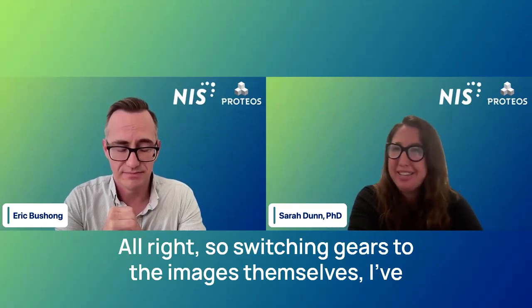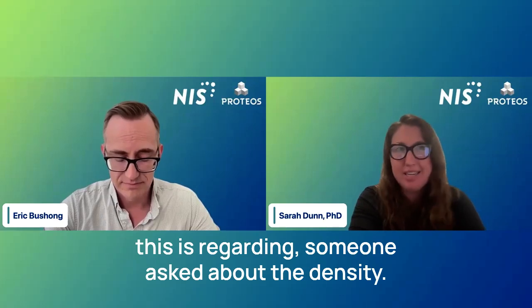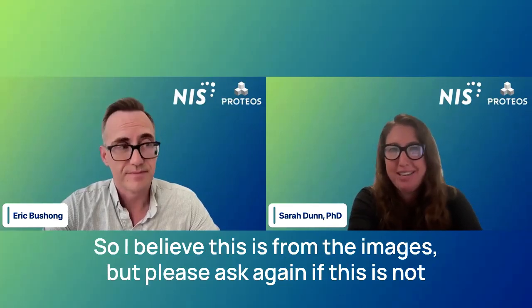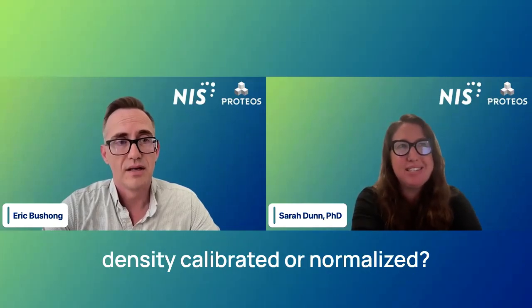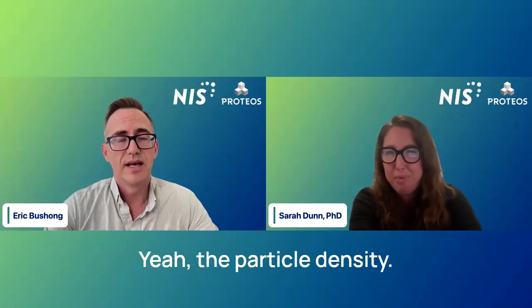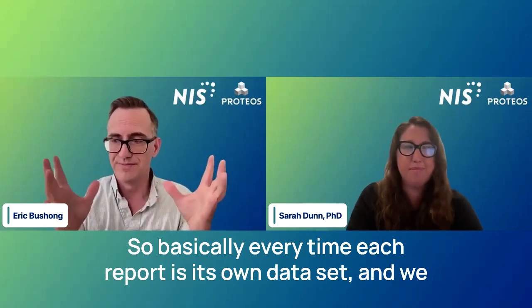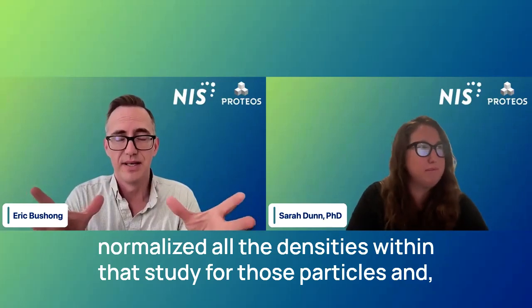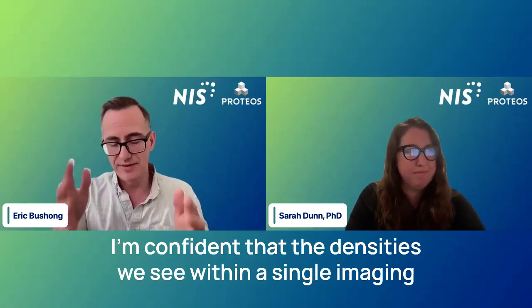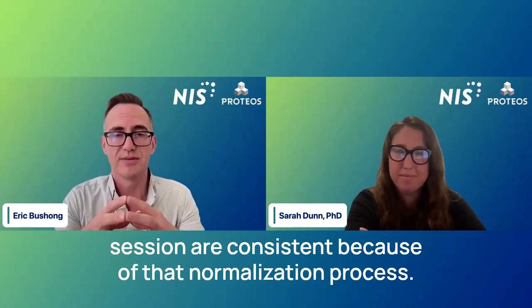Good. All right, switching gears to the images themselves. Someone asked about the density. I believe this is about the images, but please ask again if this is not how the question was meant to be asked. How is the density calibrated or normalized? Yeah, the particle density, I understand. It's not calibrated. Basically, each report is its own data set, and we normalize all the densities within that study for those particles. I'm confident that the densities we see within a single imaging session are consistent because of that normalization process.